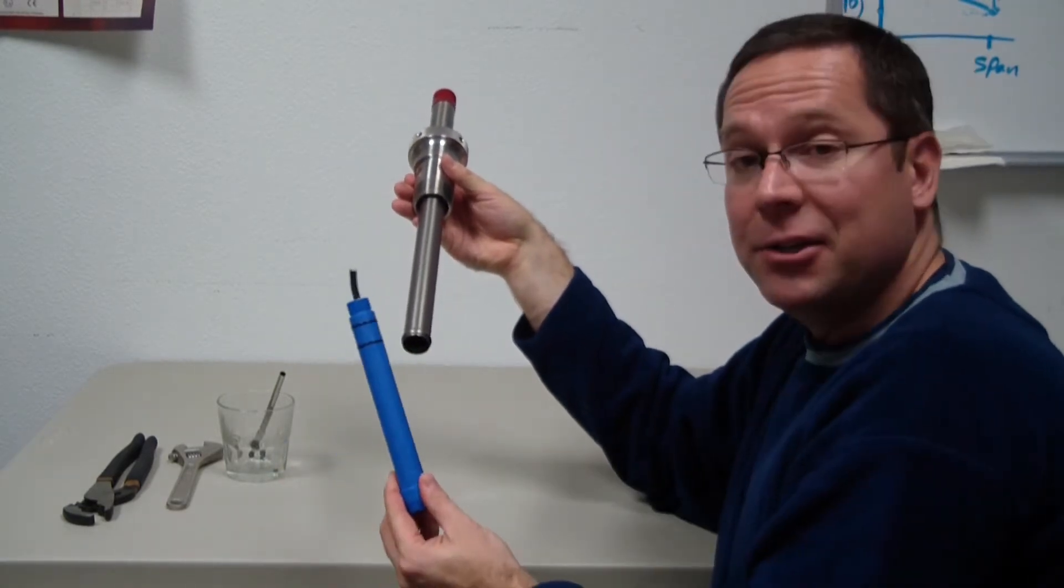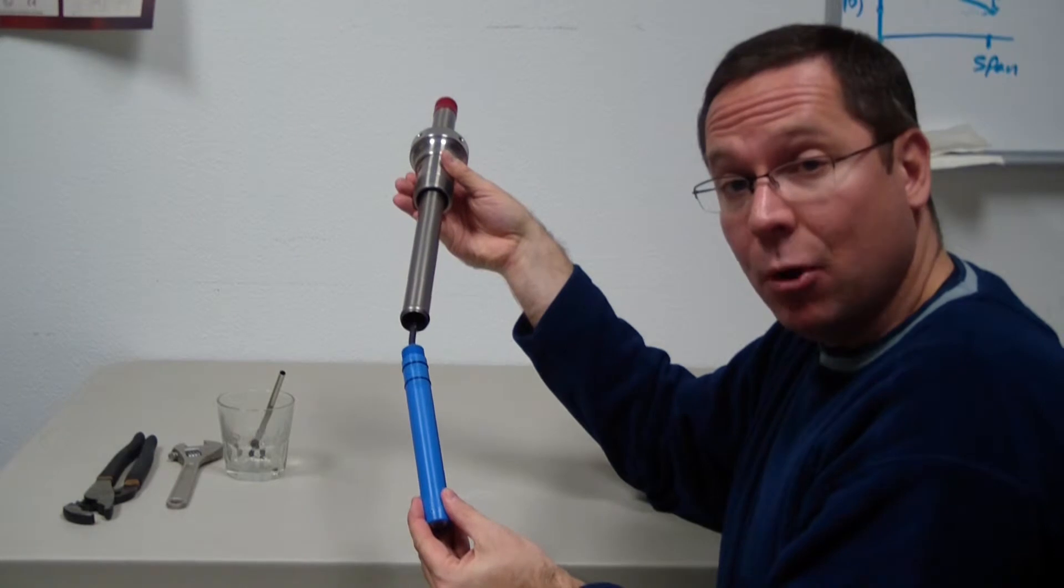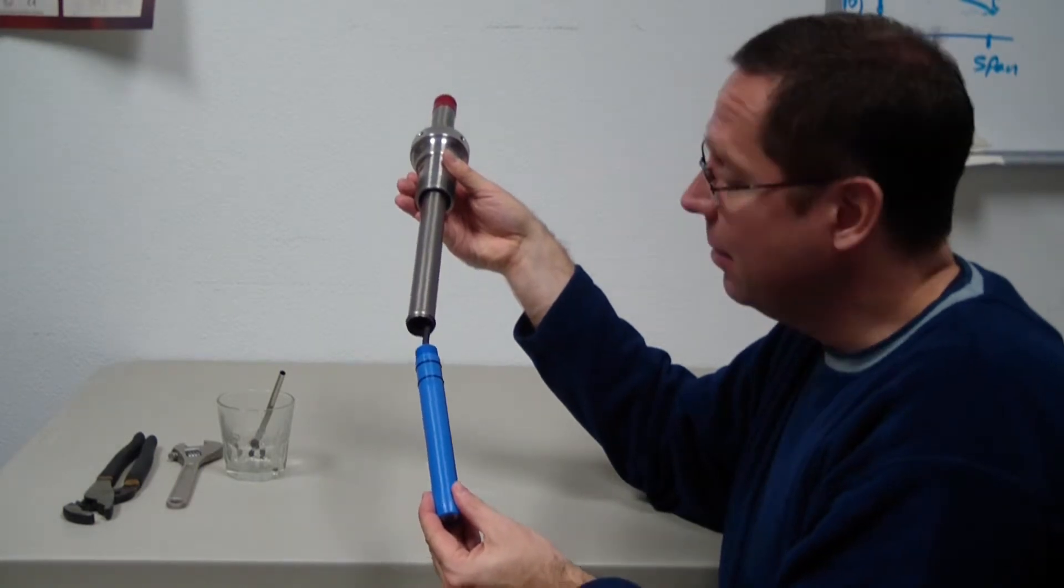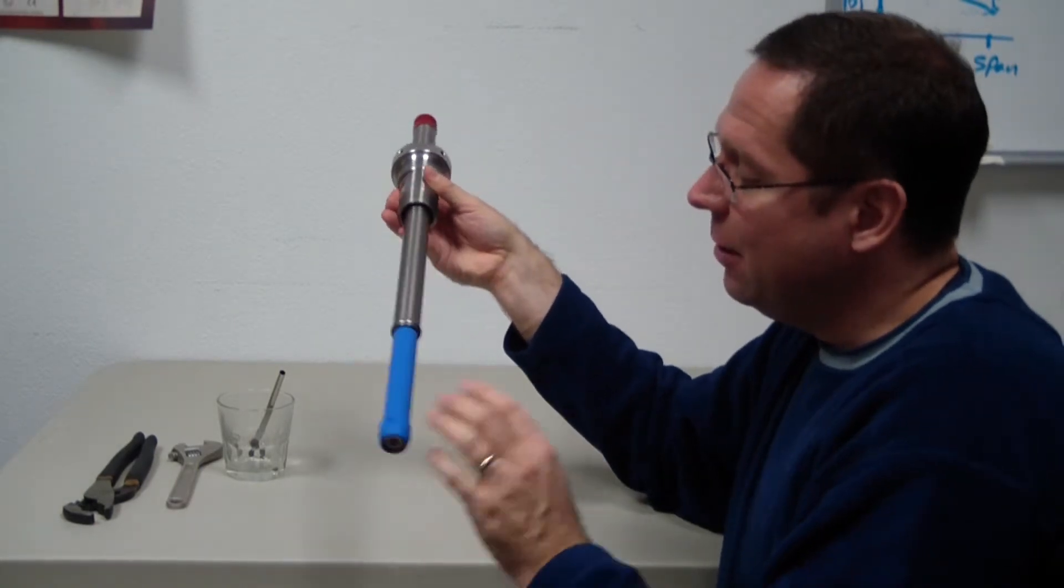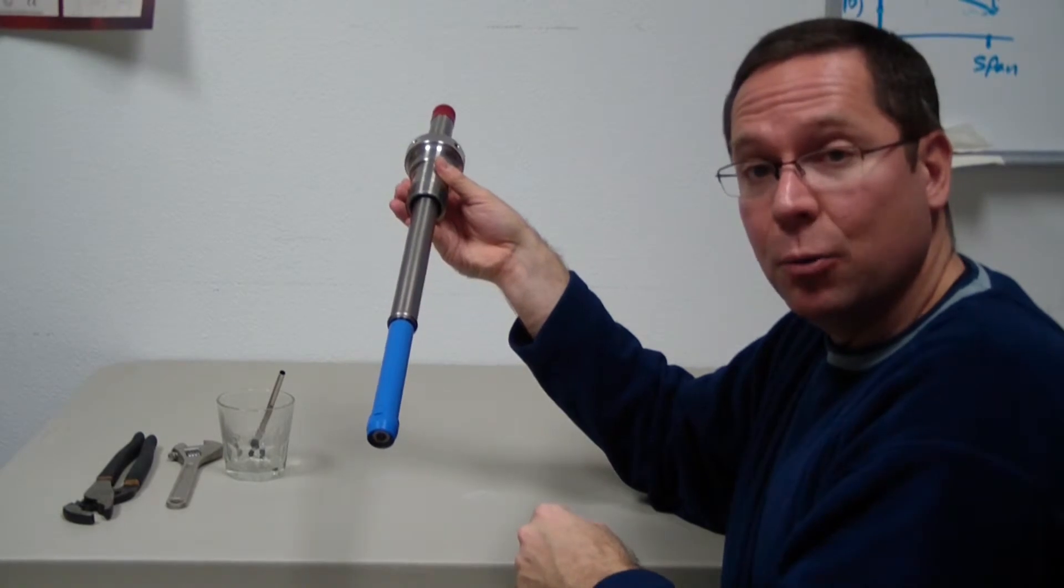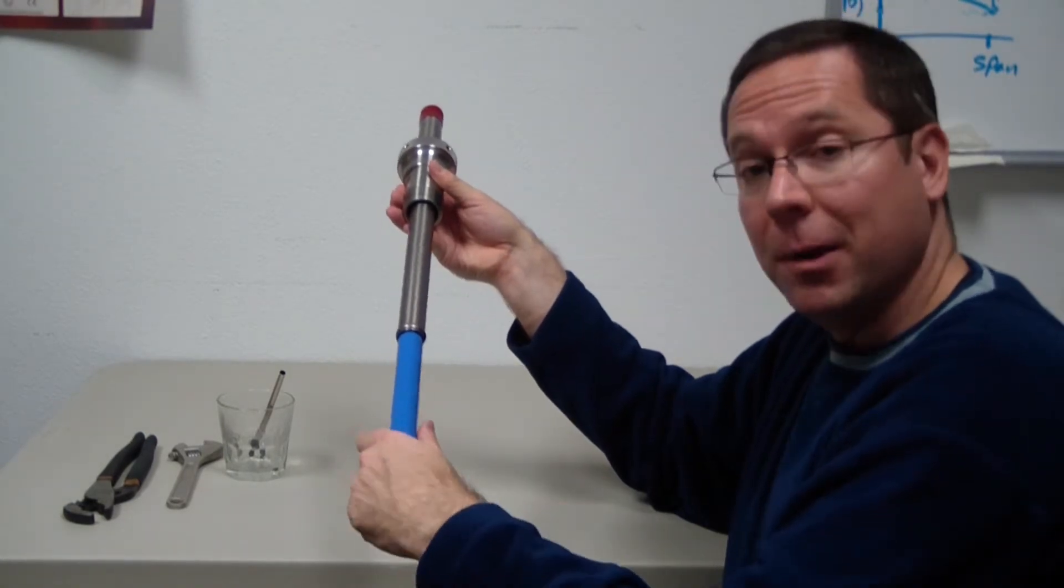I would take my pH sensor with the cap off, thread the cable through the sheath, insert the sensor, and you can use a little silicone lubricant here as well. That helps things go together easier.